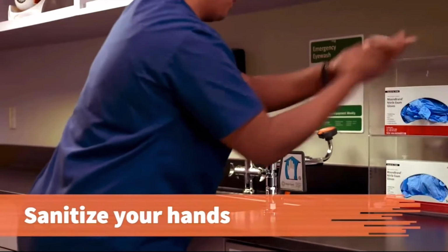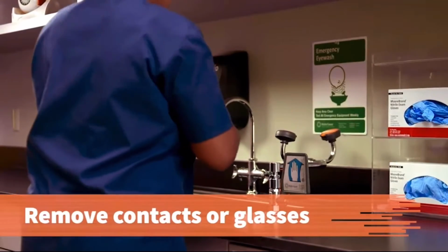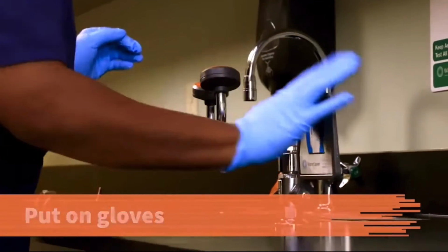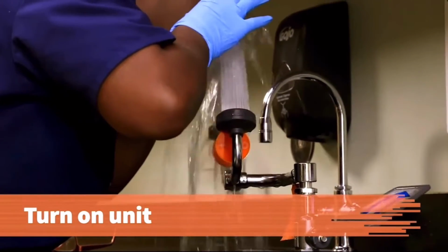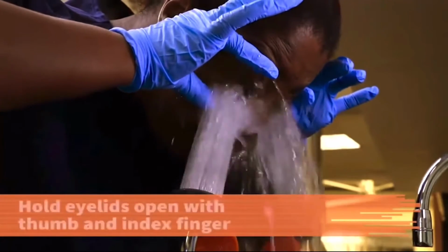Wash your hands or use hand sanitizer. Remove contact lenses or glasses. Before touching your eyes, put on gloves. Following the manufacturer's directions, turn on the eye wash unit. If it is a plumbed unit, the control valve should remain on until the unit is manually shut off.